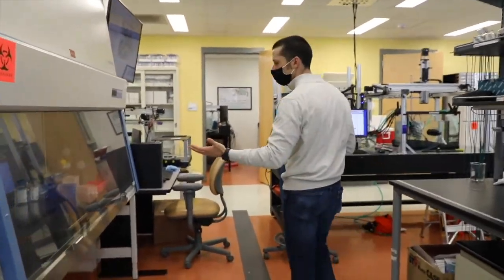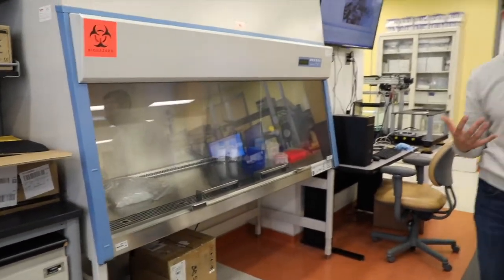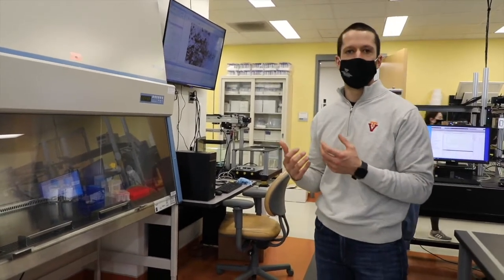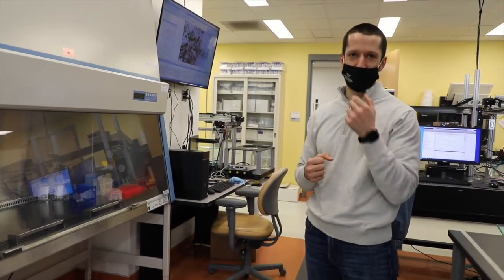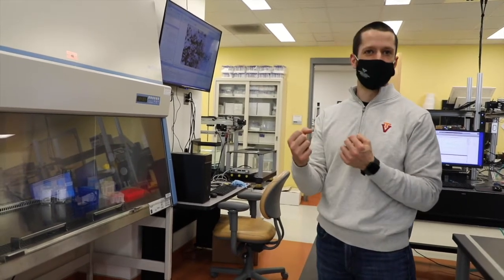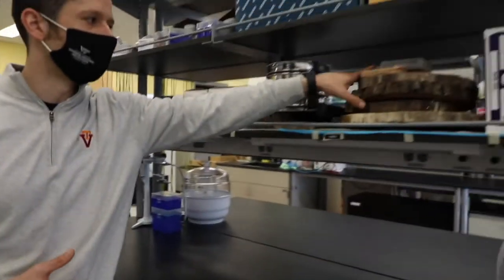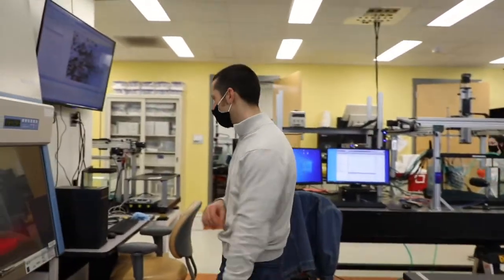In addition to this, we have multiple cell culture hoods. So those of you who are interested in more biologic studies, this is for our DNA-based work, as well as we do a lot of cell-based studies looking at the effects of histotripsy or other focused ultrasound, including our nanoparticle-guided histotripsy projects, looking at what's the response of cells to this therapy, what's the activation of the immune response, and other things. You can see here, I mentioned timber, so even though we're a biomedical lab, we have our timber samples that we're trying to get DNA out of.